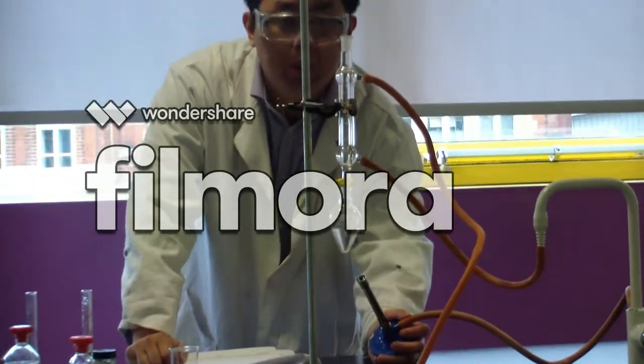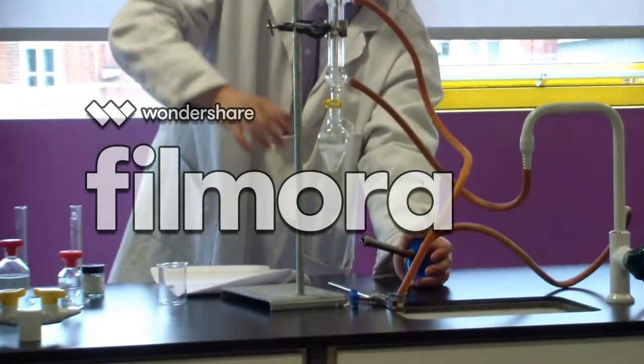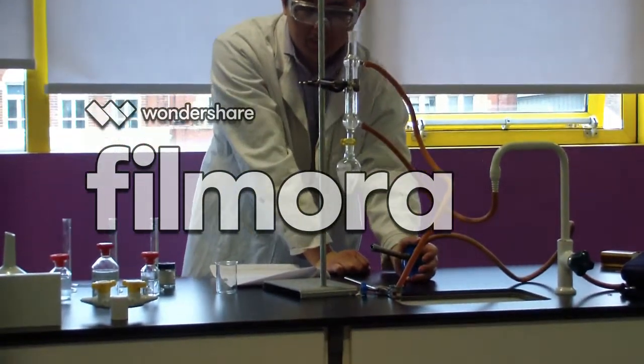As you can see, I'm using the blue flame. If you can, just find a position. You see how it's just boiling, but it's not over bubbling. So for me, this is the best position.